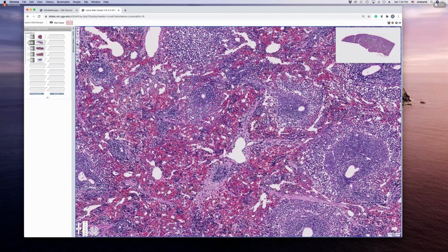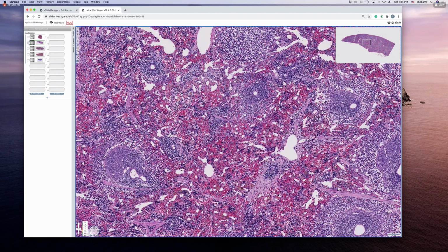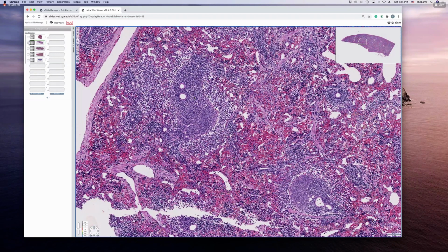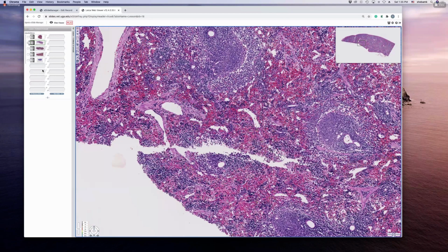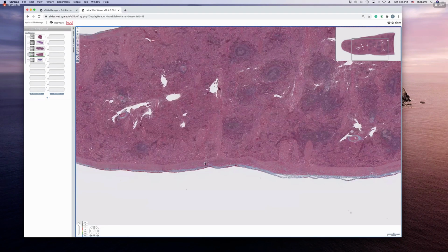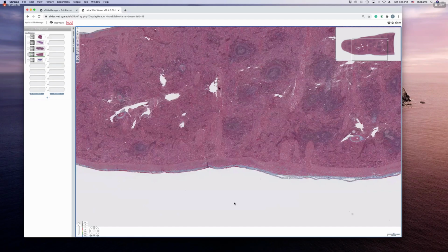So let's go. Same thing, lymphatic nodules here, PALS here, central arteriole right here. So that is it about the spleen. This structure here is the bovine spleen. Here again you can see a big, thicker capsule. Look at the capsule. See how thick it is. All this is smooth muscle, by the way.